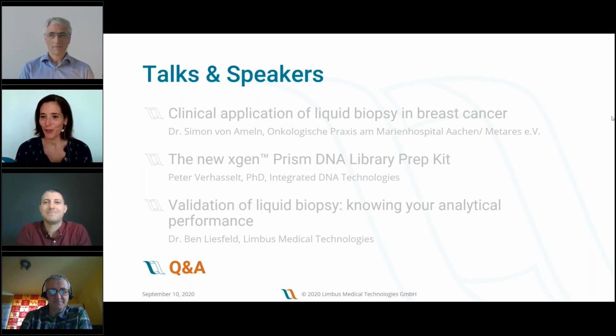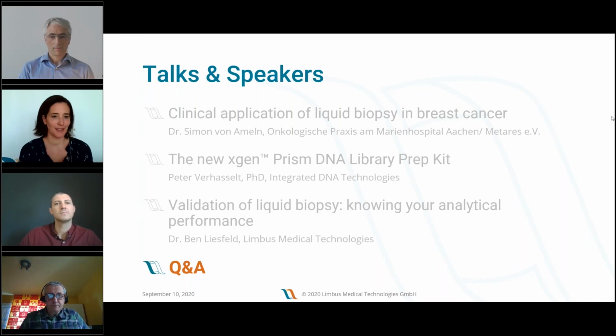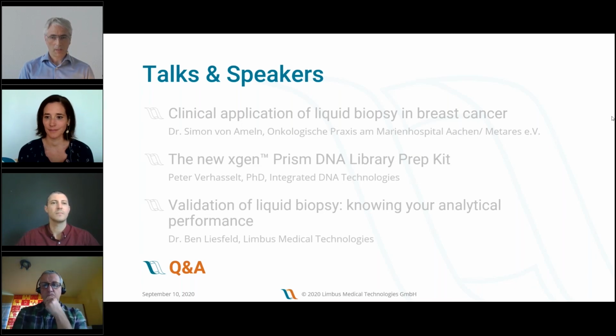Hi again. I have a question regarding the validation. For Ben, can I also use clinical samples for validation? Yes, you can. And as I mentioned, the paper from Foundation Medicine details how they were using clinical samples.